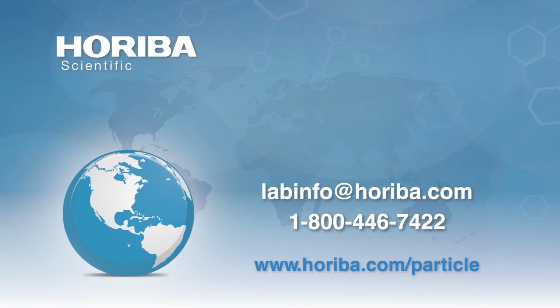If your size distribution gets particularly wide, DLS starts becoming more difficult, and then you'll shift over to techniques like multi-laser nanoparticle tracking analysis. So I guess there's two comments. One is PDI's way of keeping score about how wide is your distribution, and second is that if that gets to be too difficult, then you'll start reaching out to other techniques for broad size distributions of nanoparticles, like multi-laser nanoparticle tracking analysis. Okay, thanks.